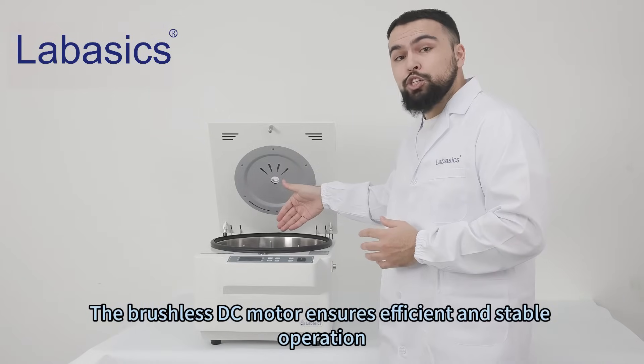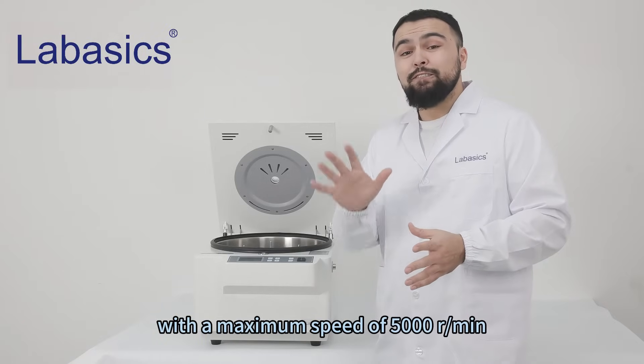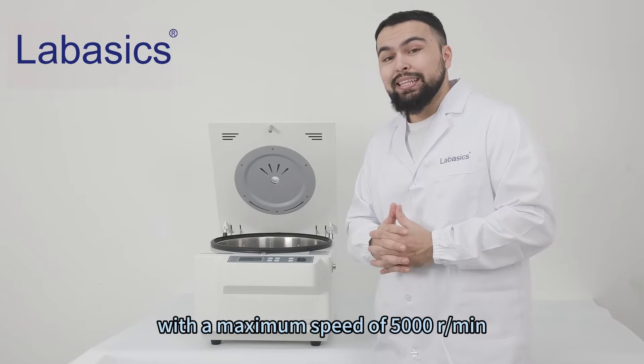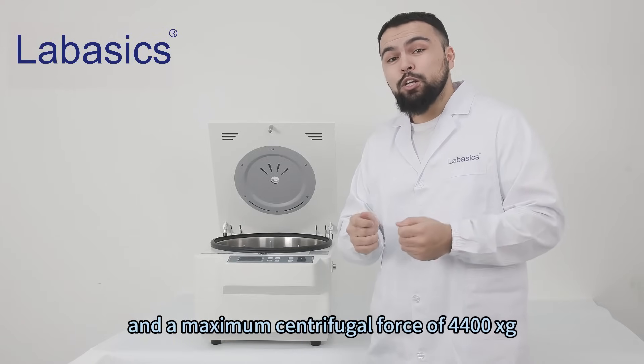The brushless DC motor ensures efficient and stable operation with a maximum speed of 5,000 RPM and a maximum centrifugal force of 4,400 G-force.